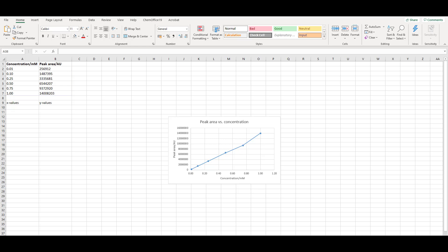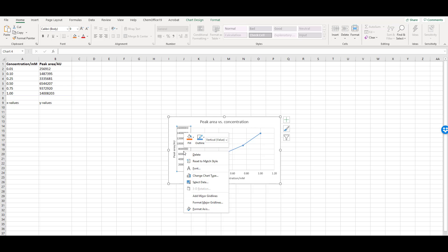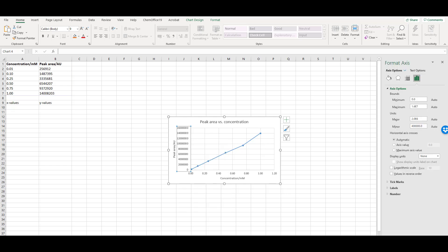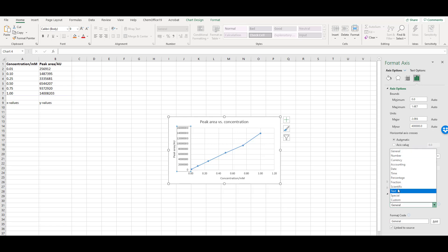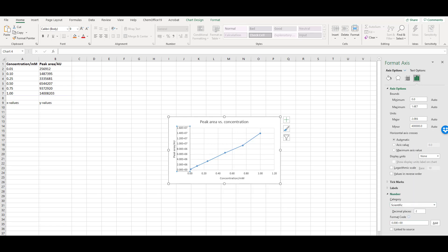As the peak area values are large, we can also put these into scientific notation to simplify the labels. Click on the axis, and a box appears around the axis labels. Right-click in this box and select Format Axis. Expand the Number section in the Axis Options window, and under Category, select Scientific. You can specify how many decimal places to display, in this case two is fine.